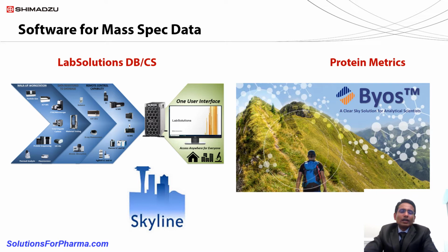But if you want to connect the entire laboratory, all instruments to one server, that is LabSolutions client server or LabSolutions CS. So all of your laboratory instruments can be connected under the same server. And then we used Protein Metrics software, that is our partner, to do the protein or mAb based analysis using LCMS. We also use one of the open source software, which is Skyline, that's for the peptide MRM analysis.